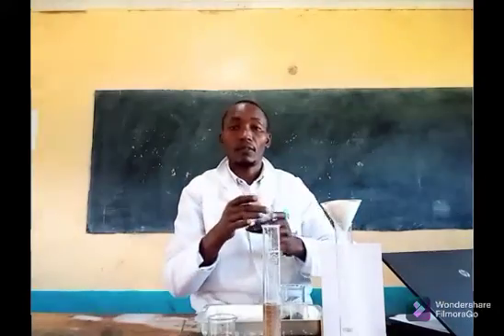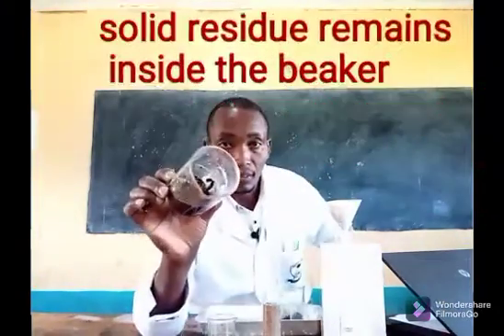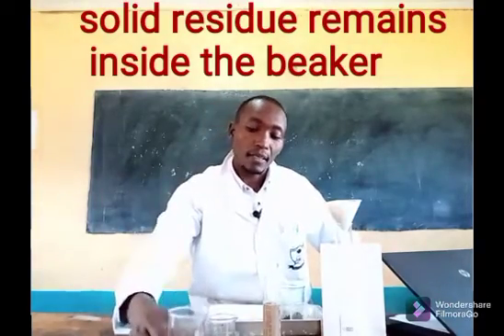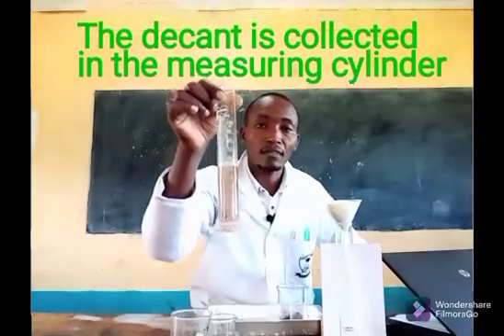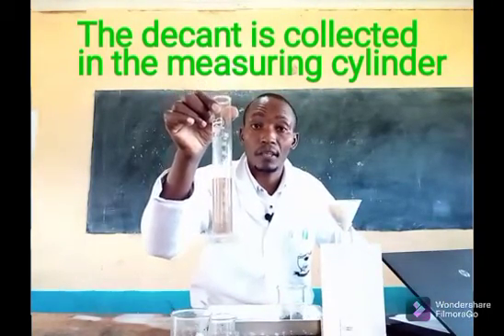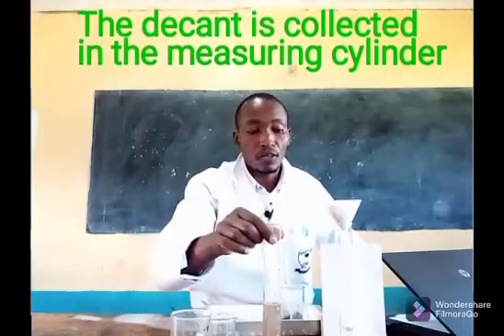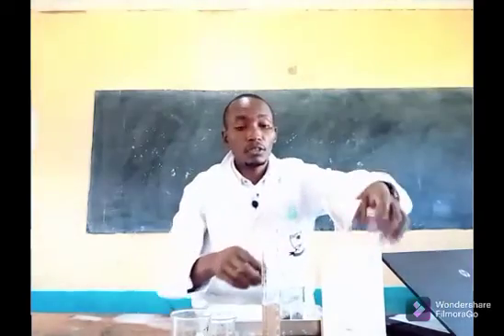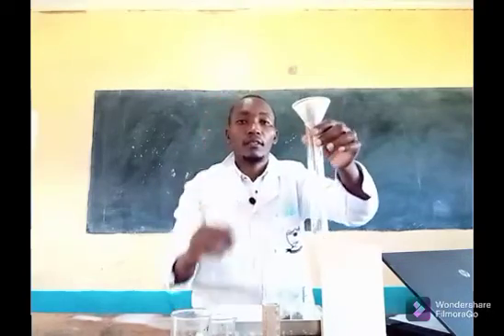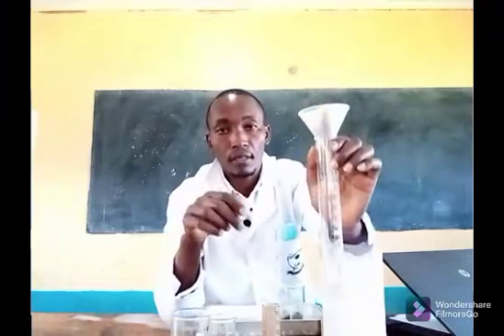Okay, so the solid particles remain in the beaker, while over here I have collected the liquid part, the water. There it is. With the filtration, we had the liquid part collected here, and the solid remains there.